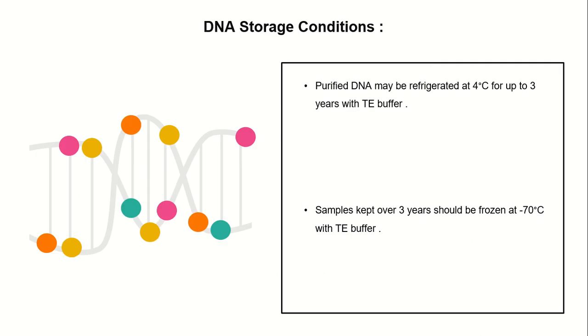DNA storage conditions. Purified DNA may be refrigerated at 4 centigrade for up to 3 years with TE buffer. TE buffer is considered a preservative solution. Samples kept over 3 years should be frozen at -70 centigrade with TE buffer.